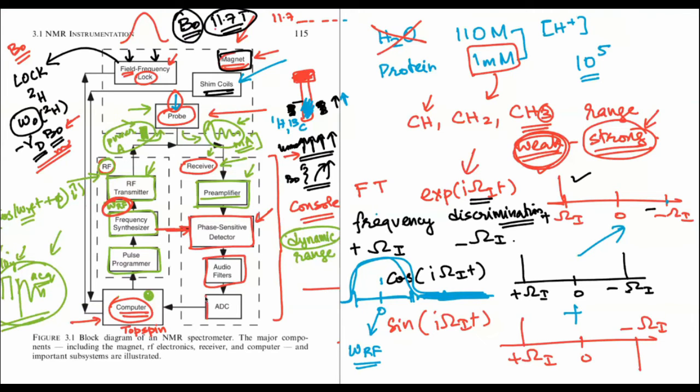The last component that's extremely crucial is called the analog to digital converter. As we have been drawing all the time, we have been drawing the FID as though it's a continuous function, right? So this is actually called the analog function. Unfortunately, we cannot determine every point on it. So what we do is discretize it, meaning that we get a bunch of points. We'll discuss more about it as we go forward. So this component ends up converting your analog signal to a digital signal.